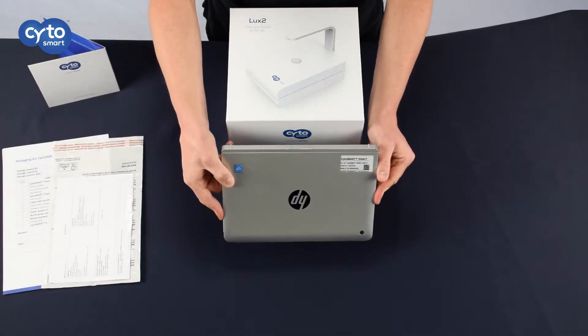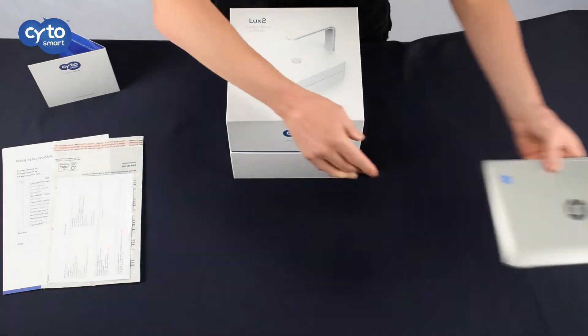A tablet for monitoring your results is also included, but the model may vary. This is included in both the trial and purchase versions.